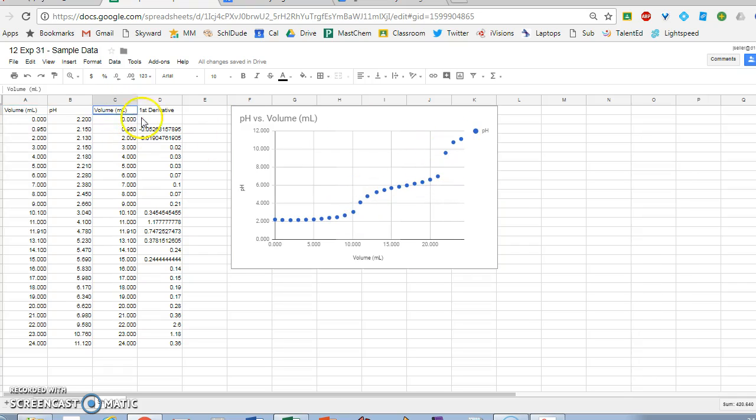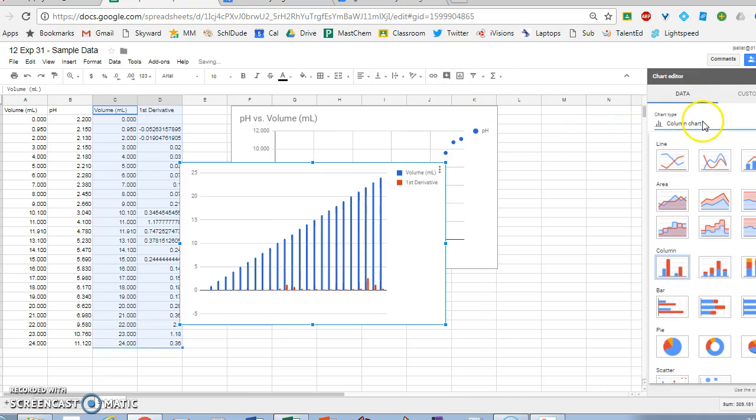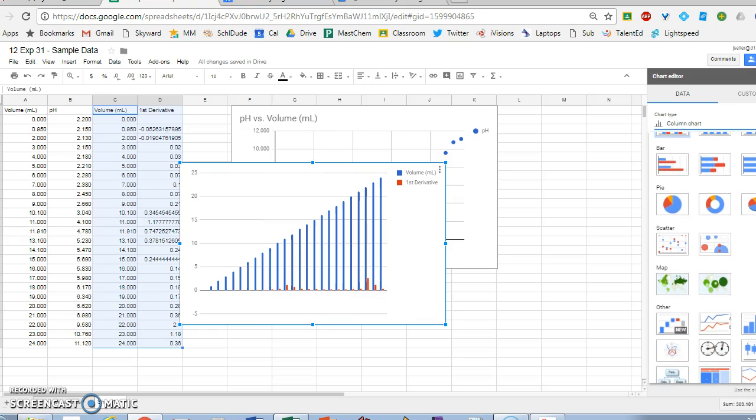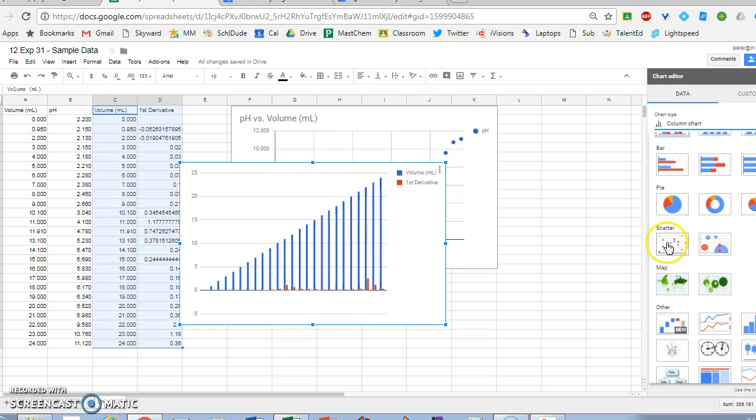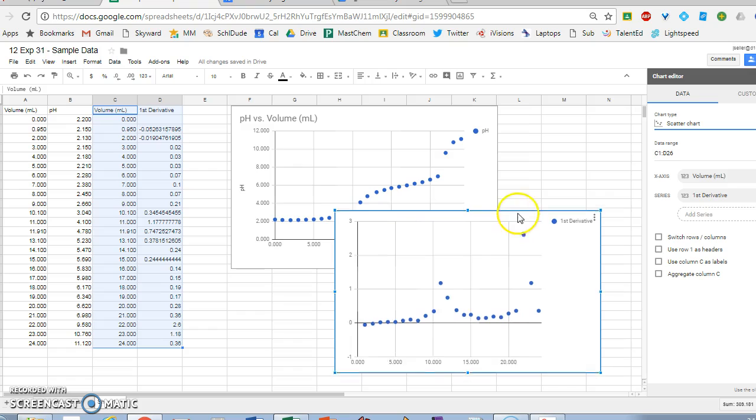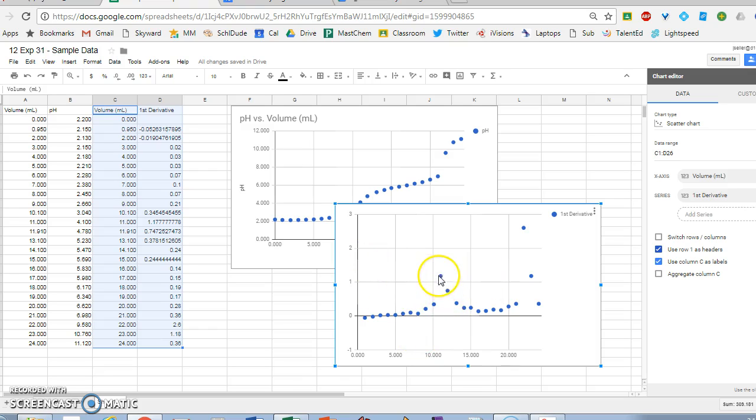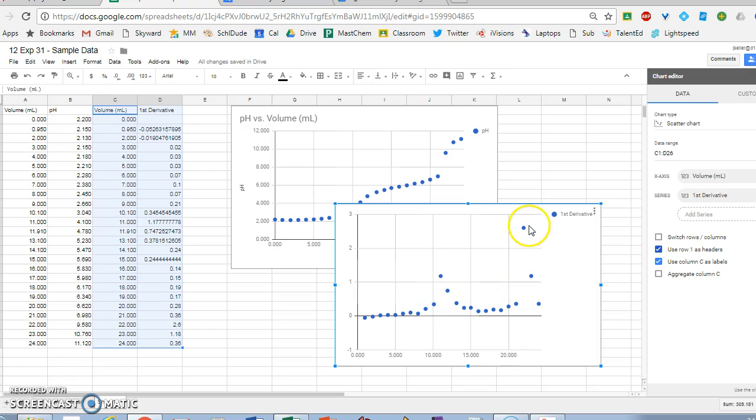On the first derivative graph, I can also make a chart that shows how the first derivative changes as volume of base changes. Here's my first derivative chart. We can use row 1 as headers, so then it knows it's volume and the first derivative. You can see here's my spike at the first equivalence point and my spike at the second.